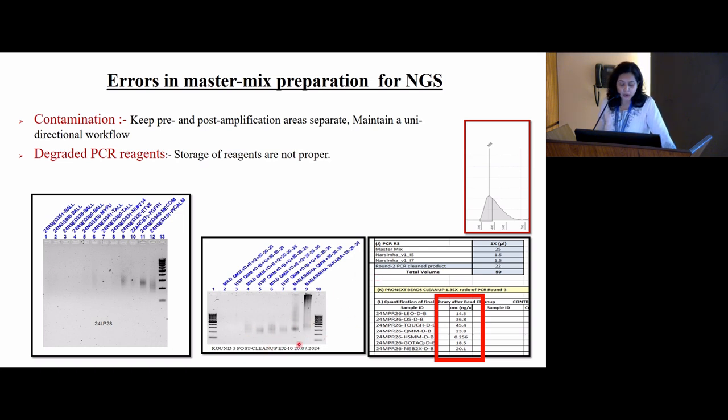So now I have to choose which is the best one. Then I have to do the whole library preparation with this, and when we do the TapeStation, we can get these results and see the band of interest over there. Only then can we say that we can proceed with that and move forward.